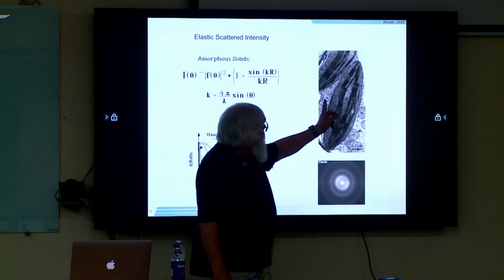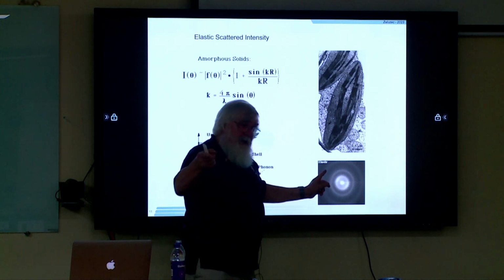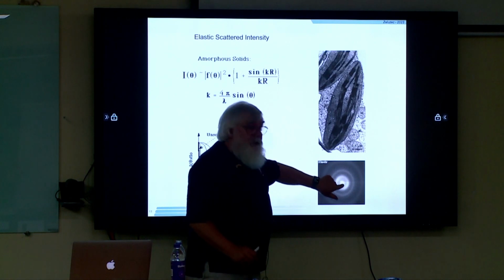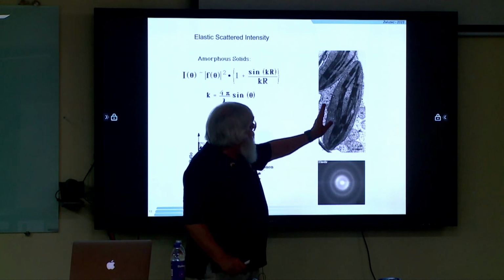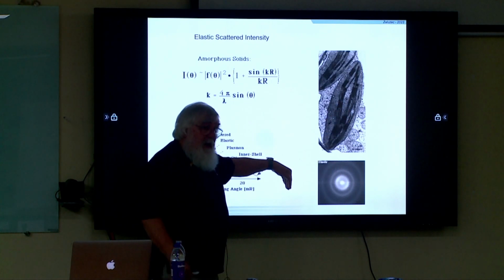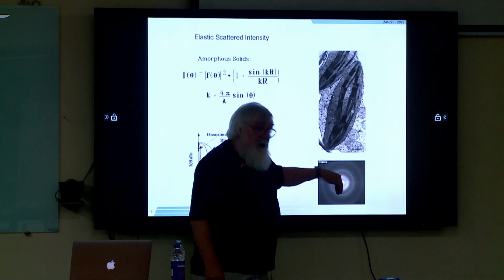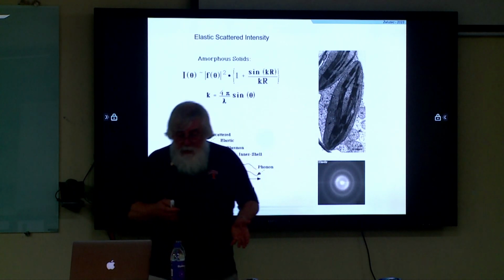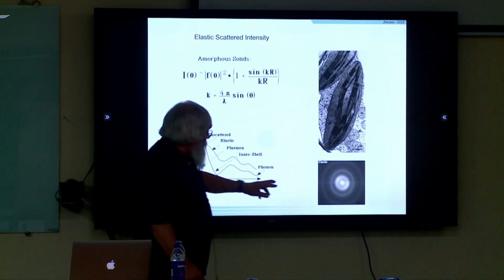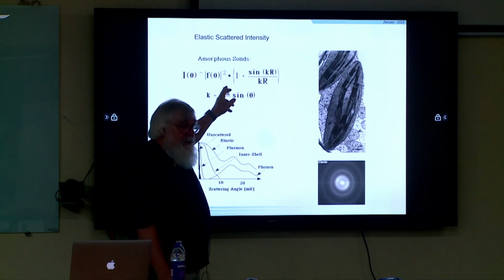This is a lower atomic number. The information is scattered off at an angle, but because it's a lower atomic number, it's scattered at a different angle. So if we put in an aperture here, different size apertures, we'll be able to say the very high dark areas are from high angle scattering, and we block that out. The lighter areas are from lower angle scattering, and we get that through. Simple mass contrast, but the mass contrast is due to the change in the intensity distribution with angle.